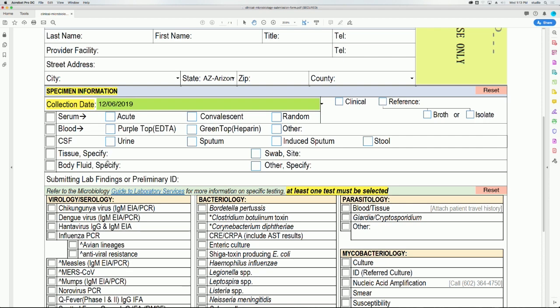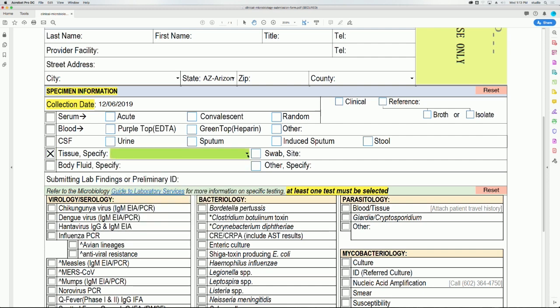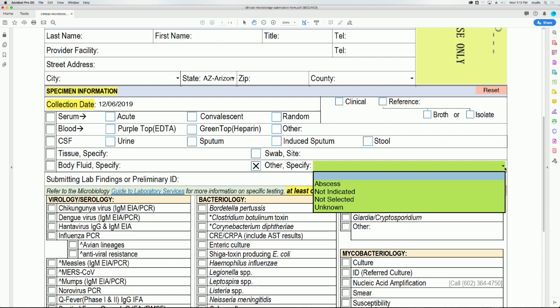If selecting tissue, body fluid, or swab site, specify using the drop down arrow. If selecting other, specify specimen source by either using the drop down arrow or directly typing onto the form if you do not see your specimen source. For demonstration purposes, we will be choosing serum and convalescent.